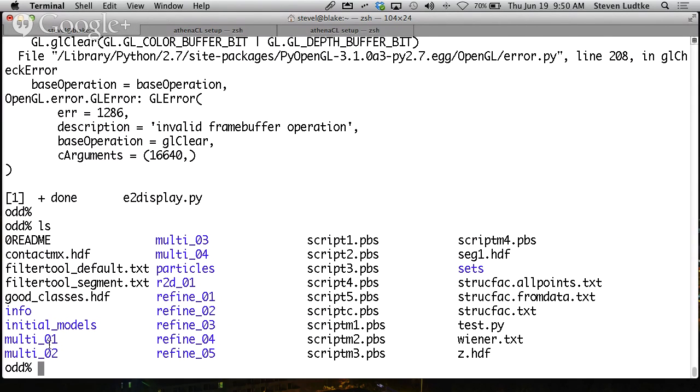So a case where you might want to do this is, say this ribosome project I'm in. This ribosome actually has a channel associated with it. So this is a heterogeneous particle population. Sometimes the channel is there, sometimes the channel isn't. And it's about, I think, 60% of the time it's not there, and 40% of the time it is there, something along those lines. So the idea with a multi-model refinement is I would give it 2 starting models.